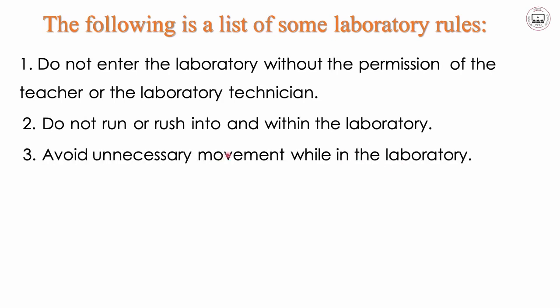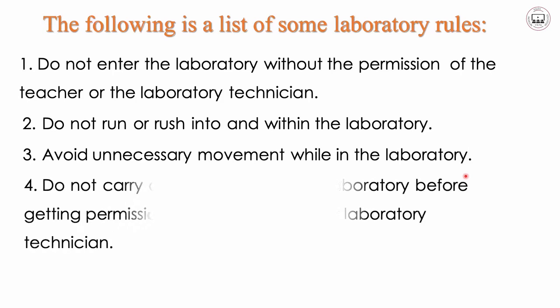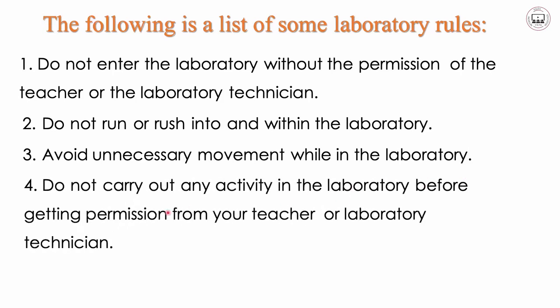Number 3, avoid unnecessary movement while in the laboratory. As you move, you can break things, or you may have some injuries, such kind of things. Then number 4, do not carry out any activity in the laboratory before getting permission from your teacher or laboratory technician.